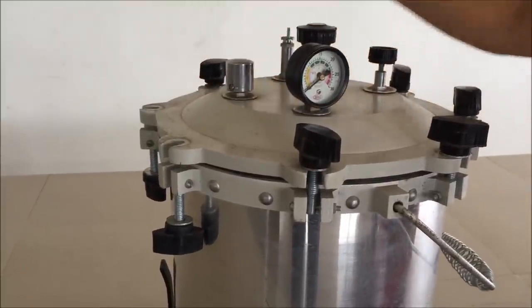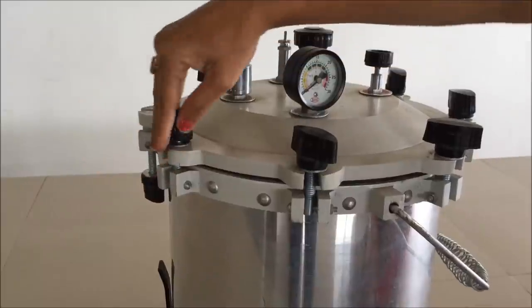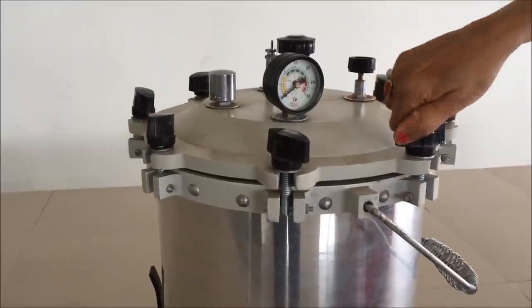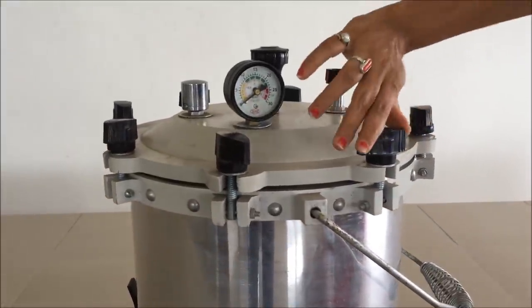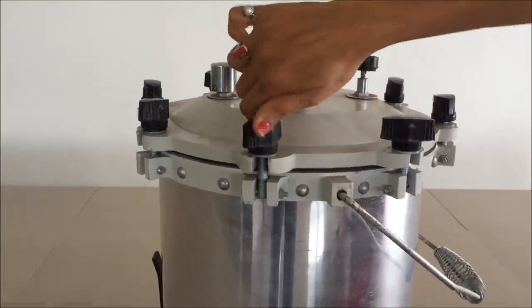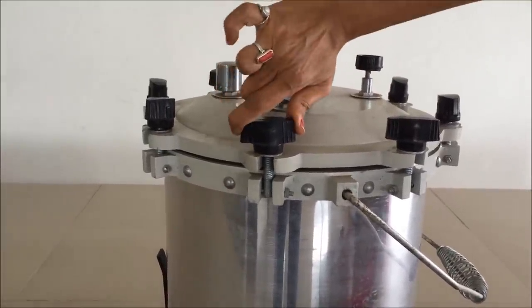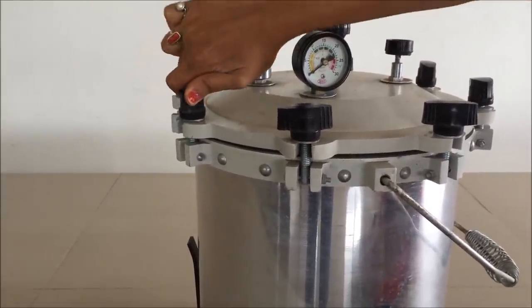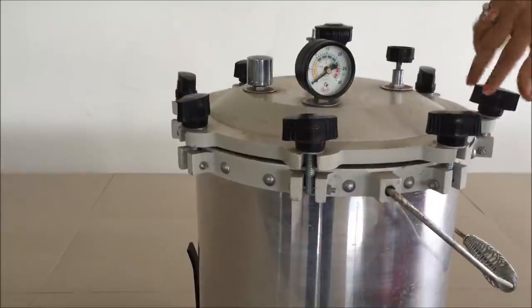Once we have placed the lid, place all screws on their respective places first. Do not start tightening. After placing it, start to rotate the screw clockwise. This will tighten the autoclave and fix so that the vapor from inside will not be able to come outside through this gap.